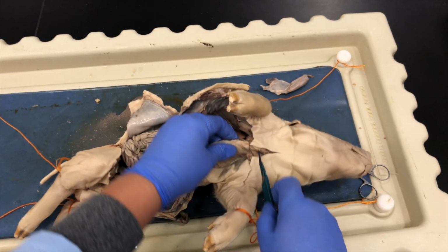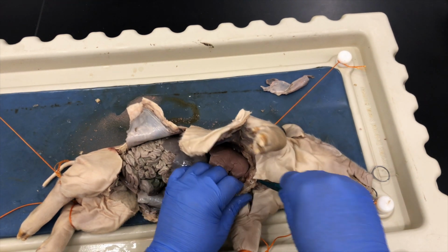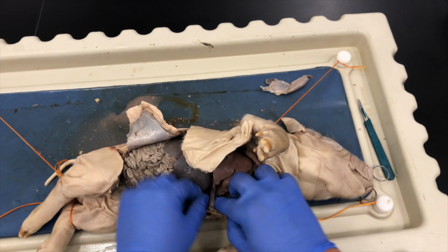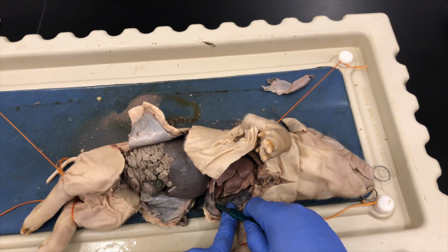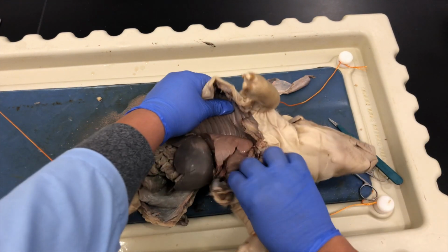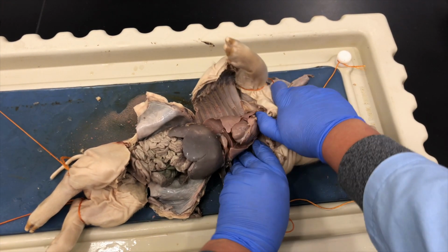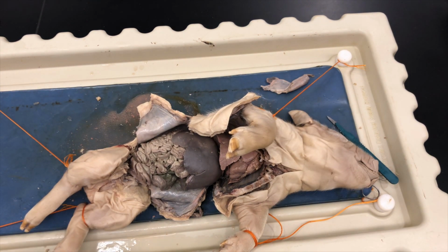Here I could use a little bit more cutting through this side. At this point I am getting the ribs and spreading them apart, also with the forelimbs. Just trying to maneuver it so that it stays open a little better.